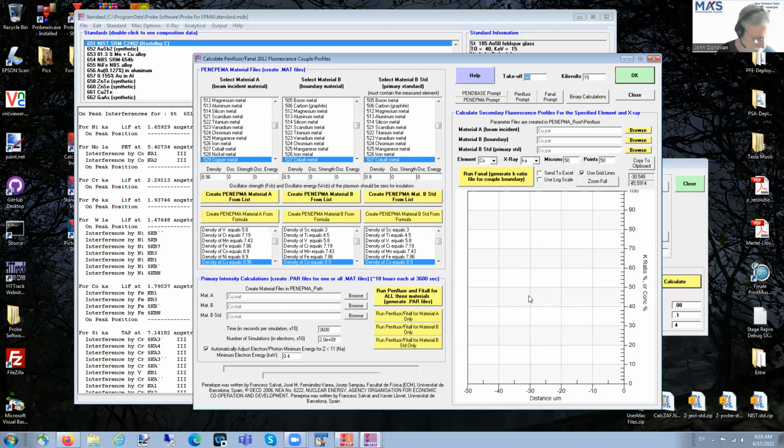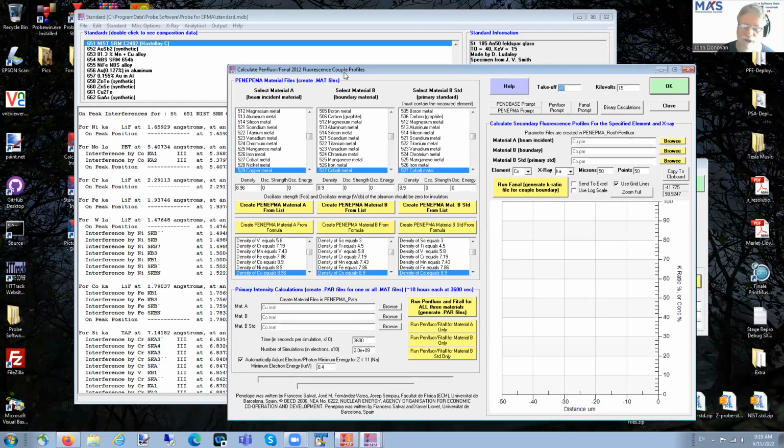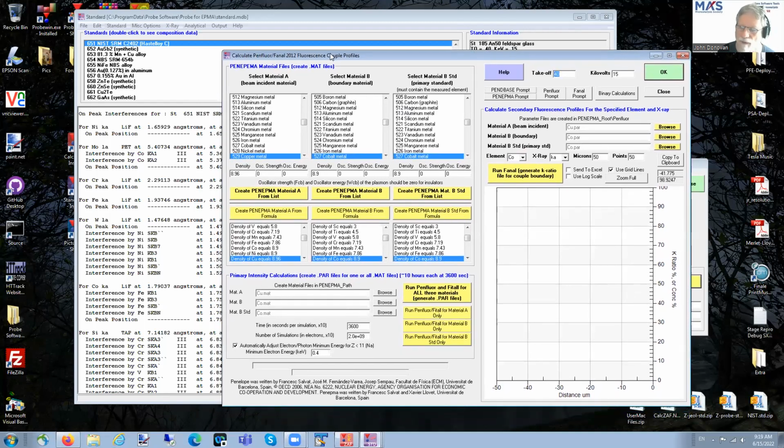And so you will think you have a trace amount of an element in your measurement when you in fact don't. I was at an AGU conference a few years ago, and I was watching some presentations, and every single one of them was showing diffusion profiles that were actually fluorescence artifacts. And it was a little bit disappointing, to say the least. Since then, we've published a paper in Chemical Geology, so I hope that more and more people are aware of this problem.